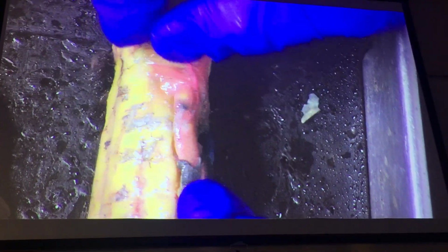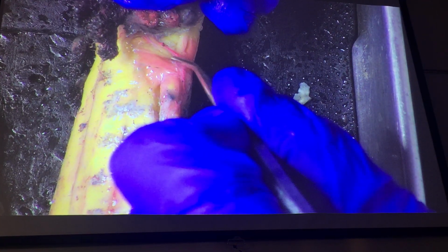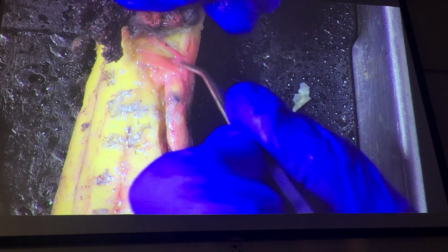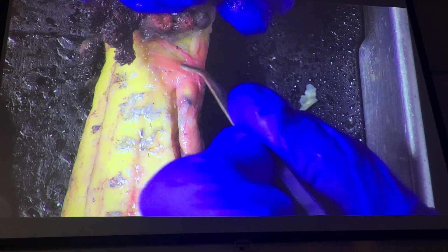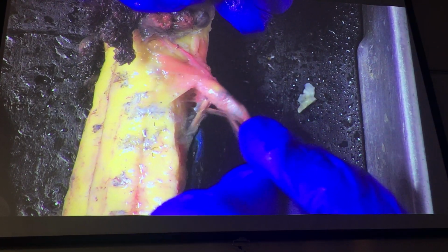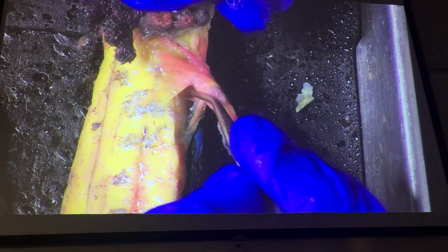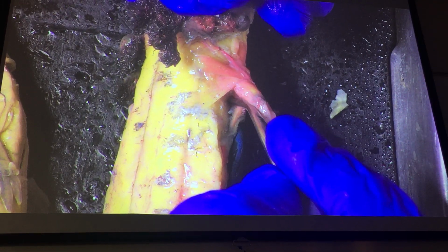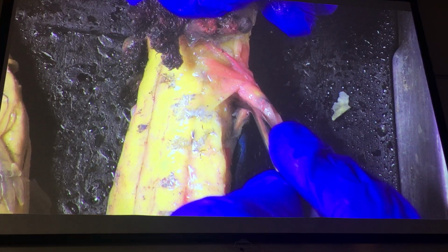This is one of those mud puppies I like for the dorsal shoulder, because we've got 1, 2, 3 muscles here, and the middle muscle is a bright pink, which makes it easy to differentiate. Here's your cucullaris, dorsalis scapulae, and of course latissimus dorsi. And Joshua, you did a nice job on protecting that. You can see it all very nicely there. And that bright pink dorsalis scapulae really makes it easy to differentiate the three muscles.